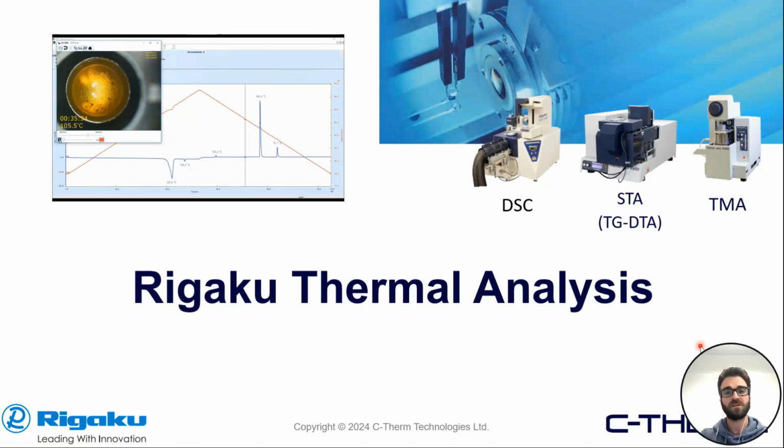So today's session will be 95% focused on thermal conductivity, and that's what we're going to take a look at. But I do just want to make note that we also work with Rigaku. They are a company that specializes in thermal analysis, primarily DSC, STA, and TMA instruments. And when we're talking about phase change materials, things like Cp, heat capacity, do play an important role. Again, it won't be the main focus, but I do have a little bit of an outro content piece on heat capacity analysis with some of the Rigaku systems.